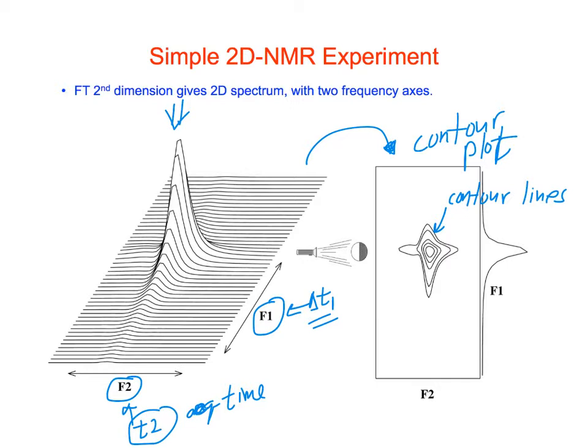Right? If you have a cursor on a one-dimensional experiment, all it's doing is kind of following the peak here. In a cursor on a two-dimensional experiment, you would see whatever it would be at that point. So this would be a cut like this, right? And if you did it right through the middle, then we'd see this. If you kept moving to the side, maybe this is not perfectly symmetrical, you'd start to get off to the side, and then if you were all the way over to here, then you would see no signal anymore.